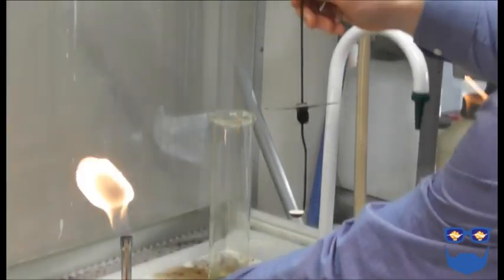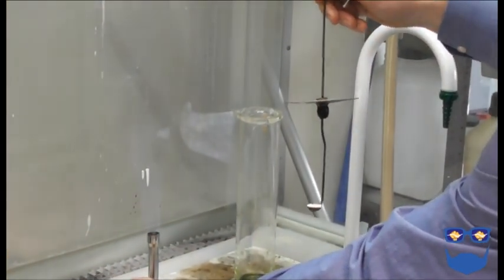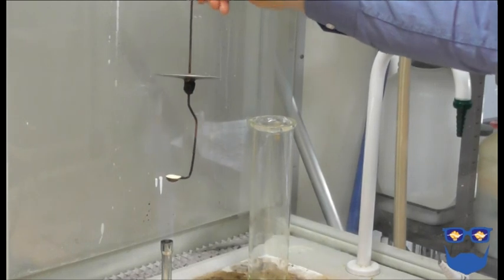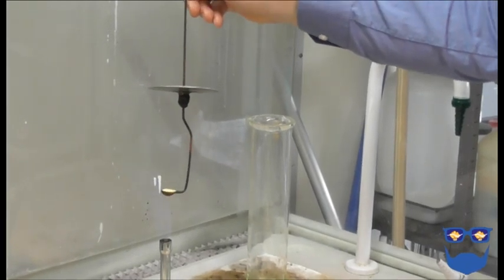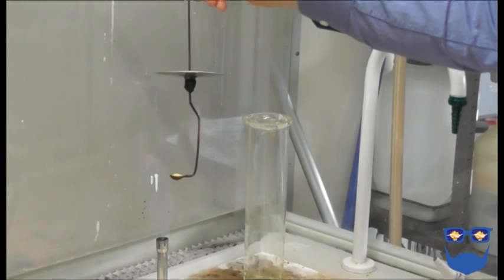Heat up the sulfur. I'm using a Bunsen flame here but I have used a lighter in the past. You're expecting the sulfur to melt and then combust with a blue flame.